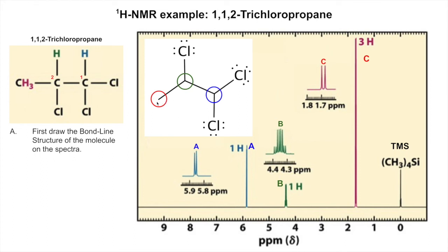So this 3 hydrogen signal here should have 1 neighbor, just this neighbor. Will it reach this neighbor over here? Let's look. 1, 2, 3, 4. 4 bonds away, but it's all through long single bonds. So nope, it won't couple to those. It should just have 1 neighbor, so N plus 1. This should be a 3 hydrogen... Oh, that's signal C actually, sorry. I got ahead of myself. That's okay. Well, that we'll see as a 3 hydrogen doublet. But let's go ahead and notice that there's 3 hydrogen, largest area signal. It's going to be C, and it is a doublet.